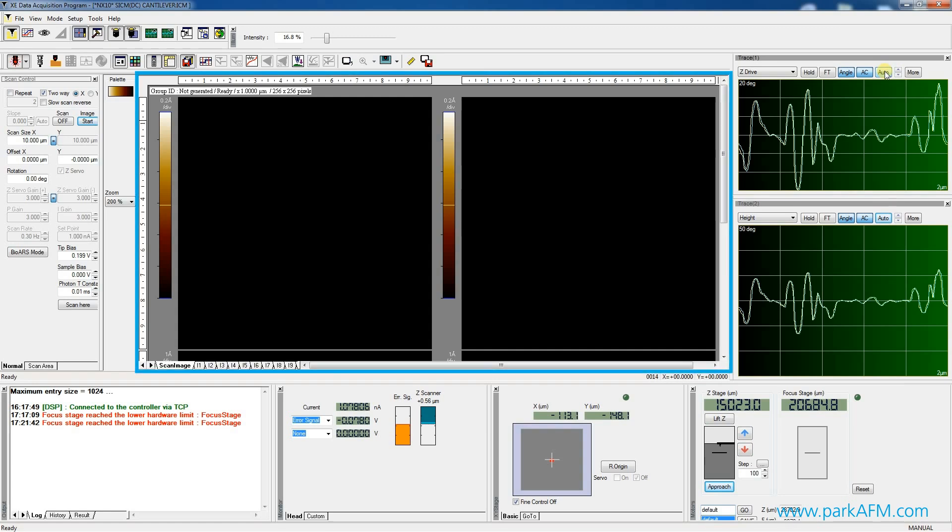In the middle, we display the image we are creating. The right hand side shows the signal that we are capturing and on the left hand side panel, we set our parameters.